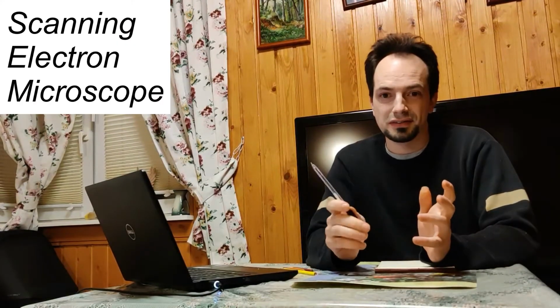So they look exactly like ordinary photos in grayscale, but they are not, and they are not obtained by any means of optical imaging techniques. They are obtained by a device called an electron microscope, and in particular a Scanning Electron Microscope, or SEM. That's the theme of today's lecture, the Scanning Electron Microscope, SEM.